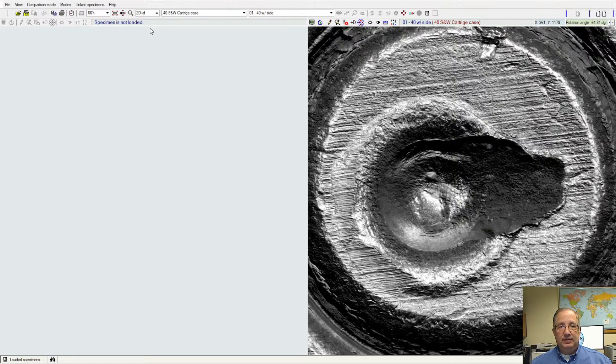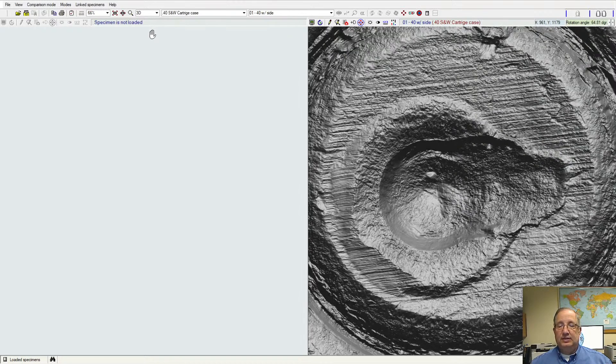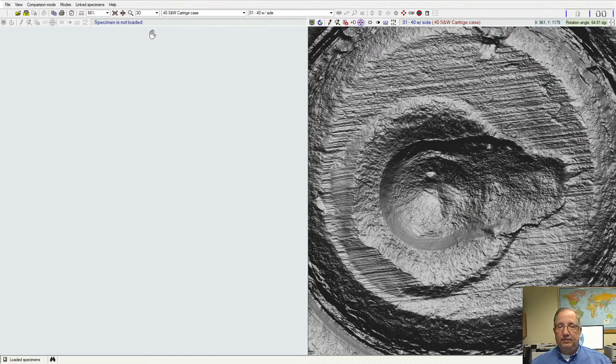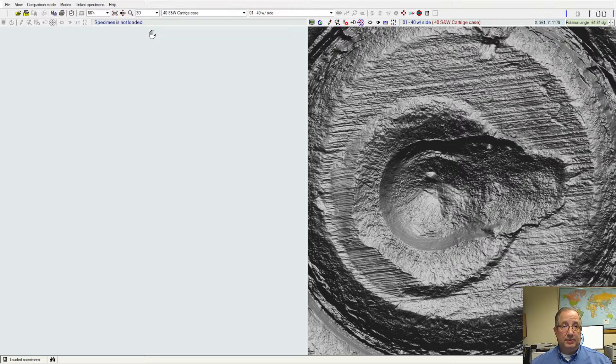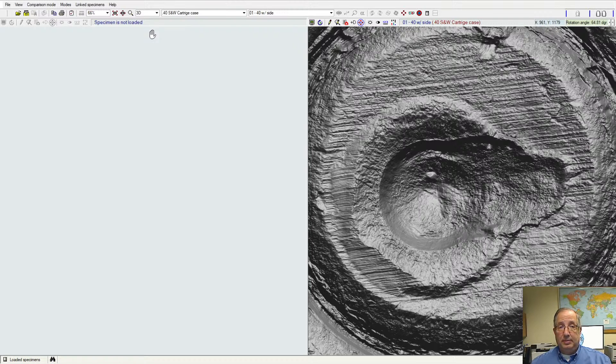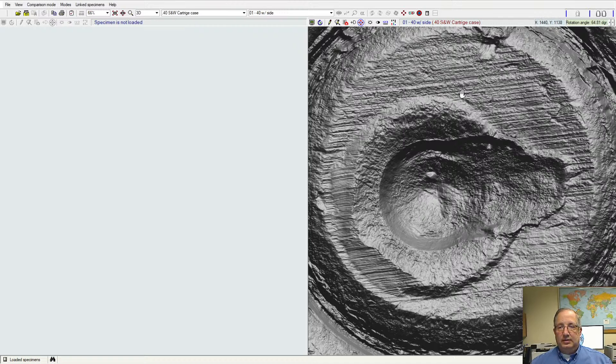And each of these just gives us a slightly different view of the sample that we're looking at to try and get that detail that we want to see for the sample to do our examination or our comparison.